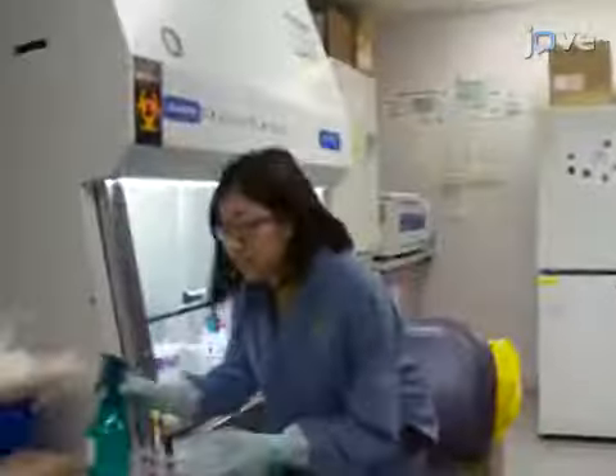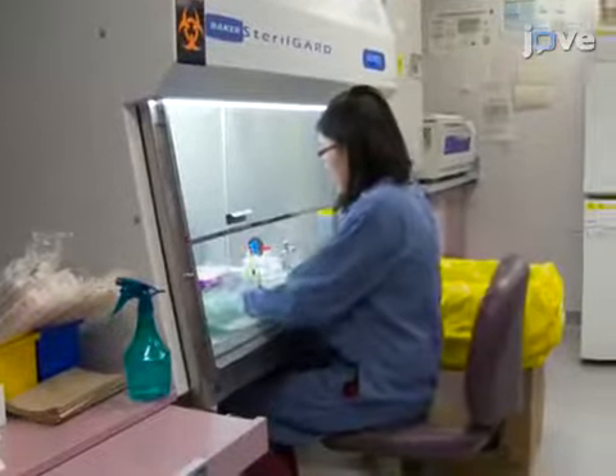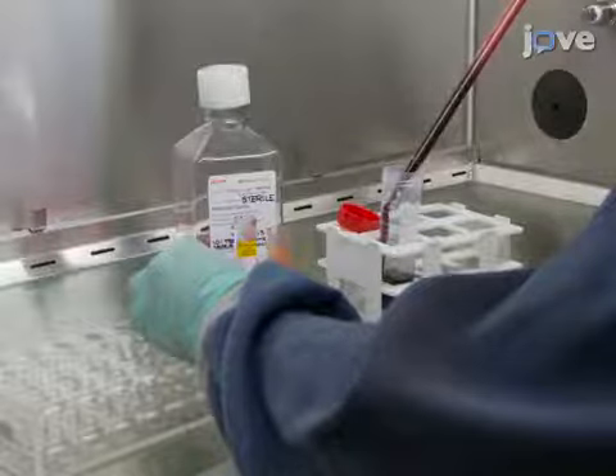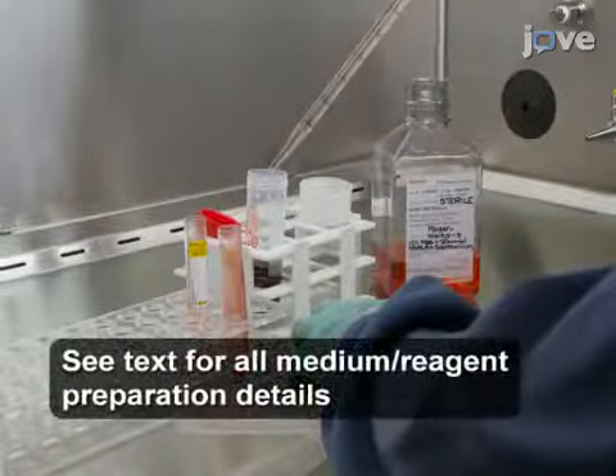After obtaining 1 to 2 10-milliliter whole blood samples from a healthy donor in vacutainer tubes containing acid citrate dextrose, the tubes are placed into a class 2 biosafety cabinet and the blood diluted at a 1 to 1 ratio in warm complete medium.